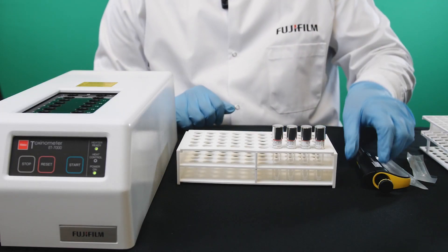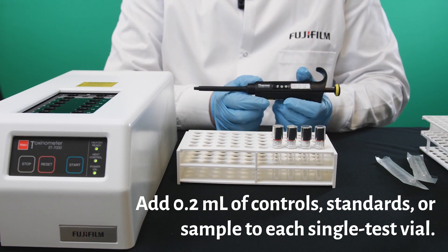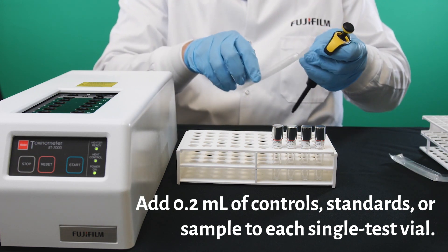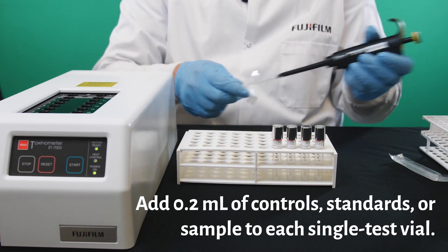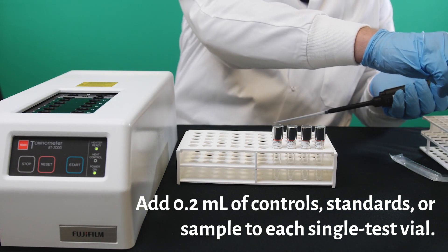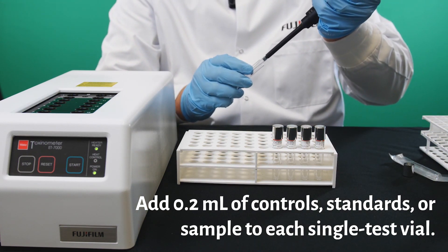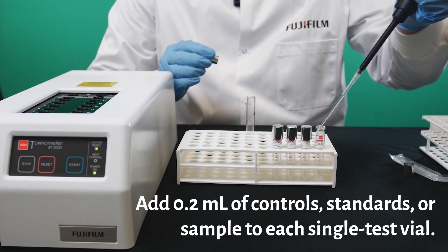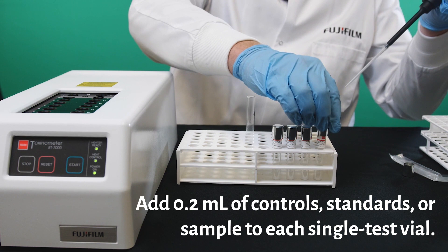We are now ready to add 200 microliters of each of the samples to each of these reaction tubes. I will go ahead and place the 200 cap on, grab one of the test tubes, and start the process of adding the sample.